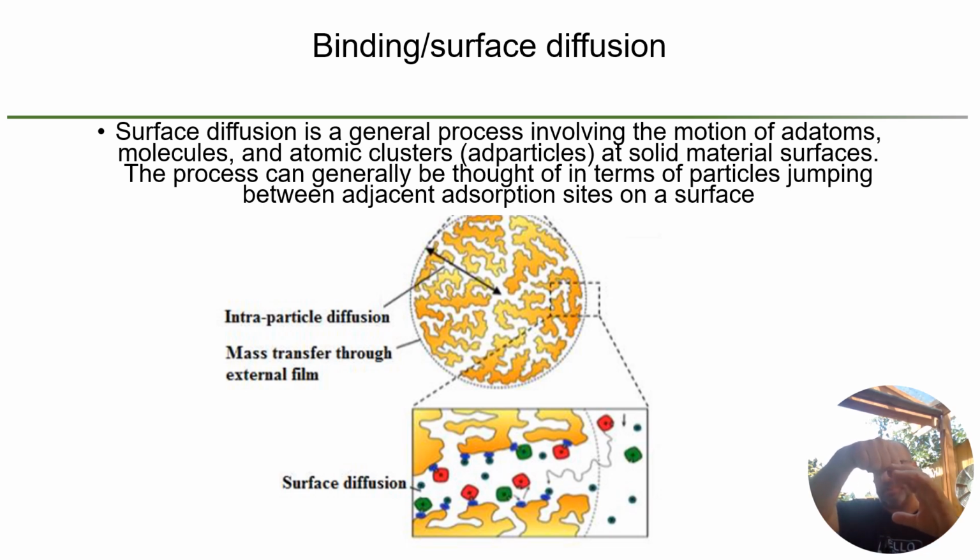The final piece of phase dynamics in liquid chromatography is the binding and surface diffusion of the bead itself and the analyte within that bead. So as it moves in through pore diffusion, then it will start to spread across that bead, and will reach equilibrium across the bead with however many particles move through that bead. That's the basis of chromatography.